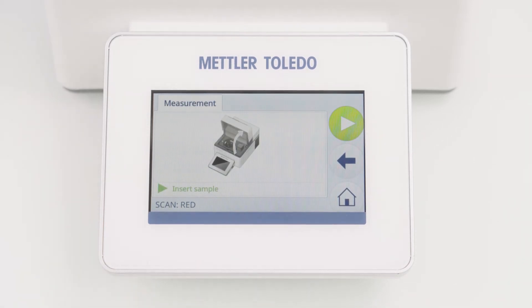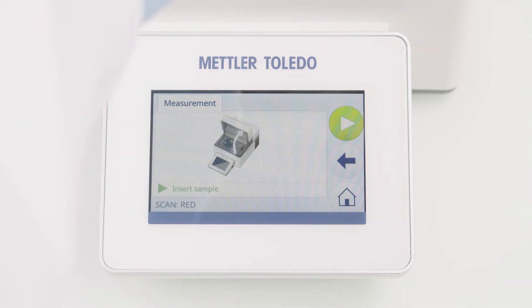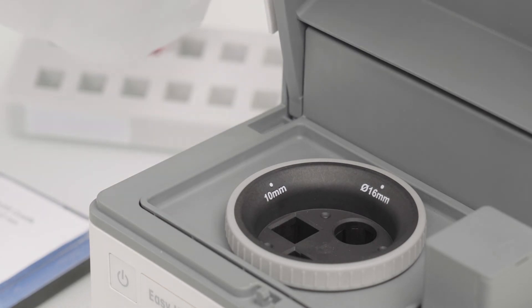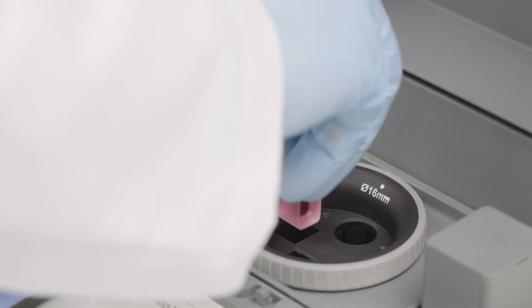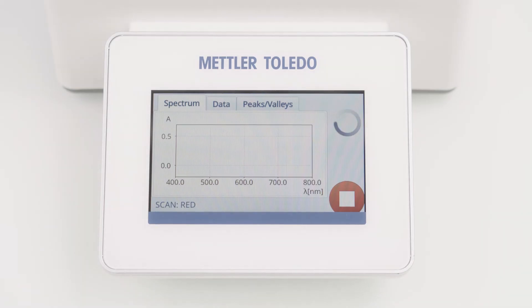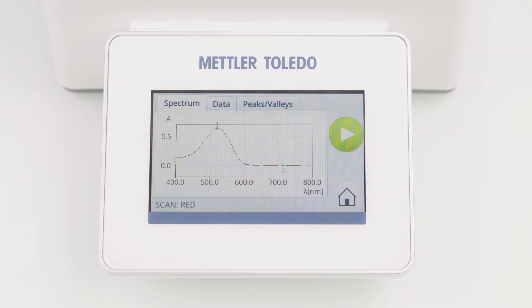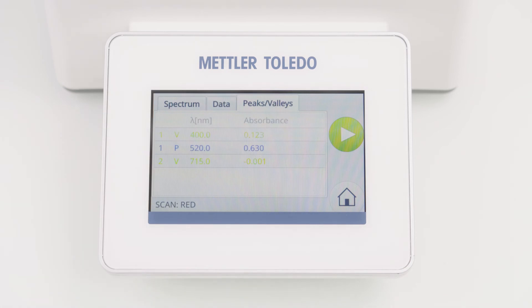Now I am asked to insert the sample. Let's open the lid again and replace the blank with the sample cuvette. I close the lid and the measurement starts immediately. The spectrum is shown live on the screen. The detected peaks and valleys are labeled in the spectrum, but can also be found in the Peaks and Valleys tab.